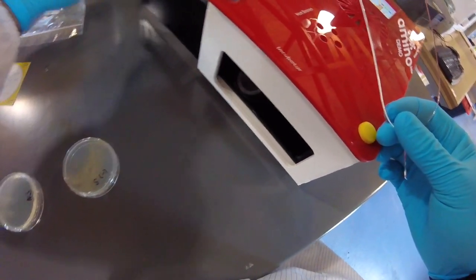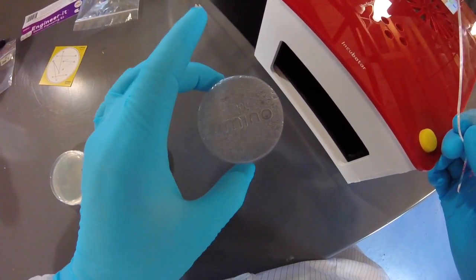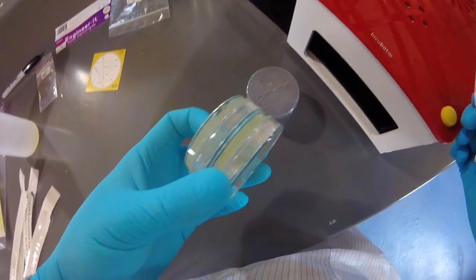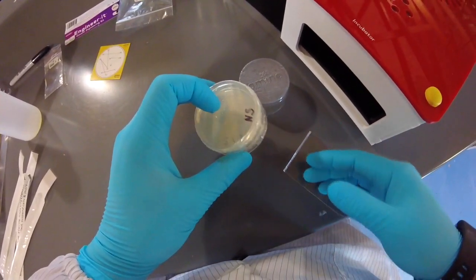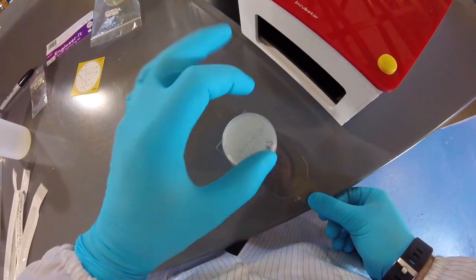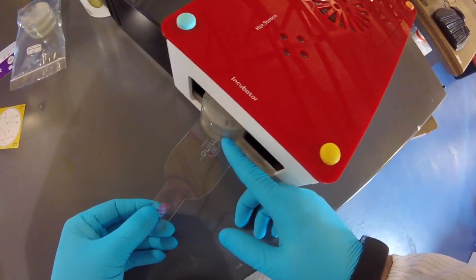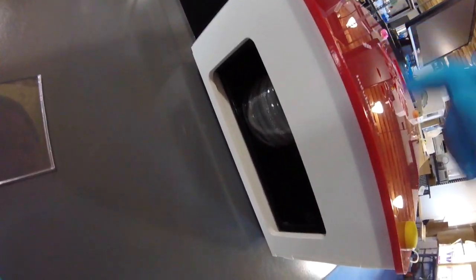All right, so I'm going to open the door here. Now within here we have what we call humidity chambers. And so what you can do is you stack your Petri dishes so that the lids are down, right? So bottoms are up, lids are down, and that helps to prevent evaporation of liquid within your agar. So you put them upside down on their lids. Then you can put the humidity chamber on, and then you can simply slide them in like a little pizza oven here, okay?